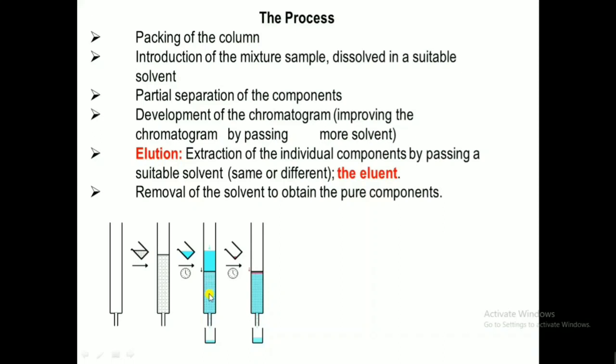The packing of the column is very important. There should not be any cracks, free space, or air bubbles trapped in the column. If that happens, it will affect the separation efficiency. If you're interested, you can watch that video link again. Then we introduce the mixture. First we dissolve the mixture in a proper solvent, and we introduce it here.